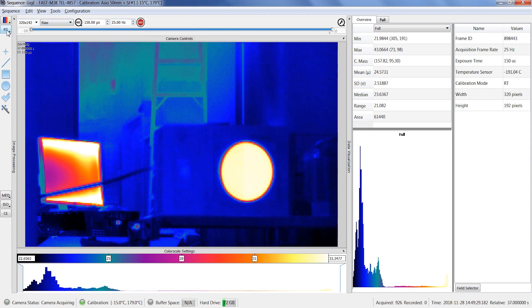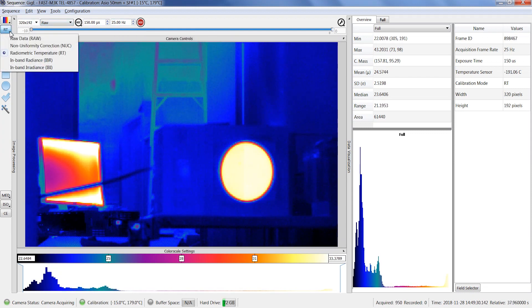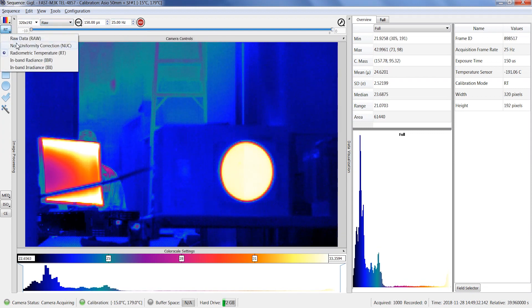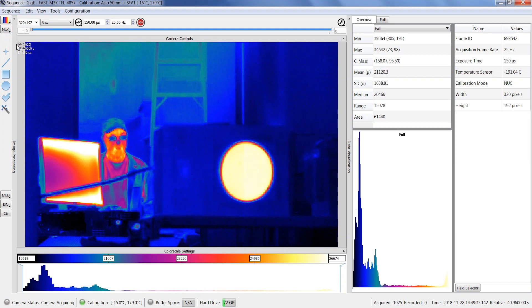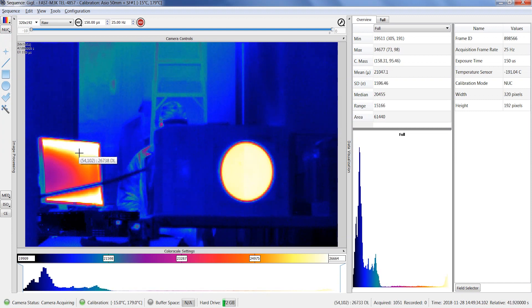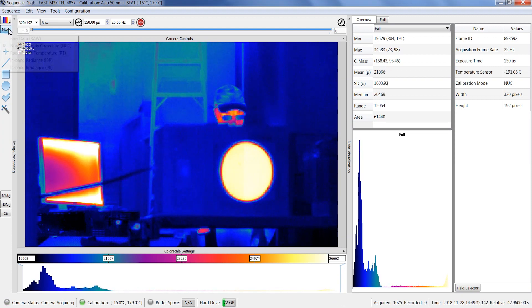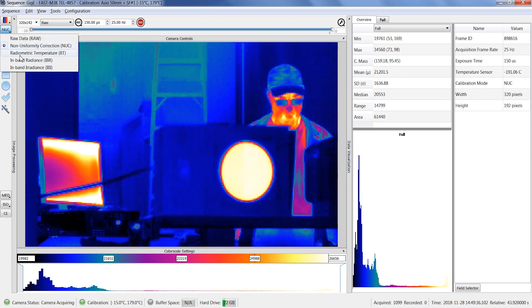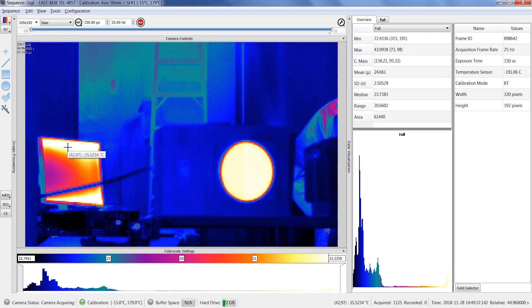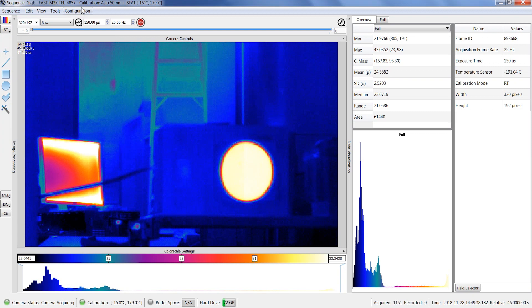Here you are able to change the calibration mode. The software calibration can allow the display of data in a different mode than the calibration that is saved to disk.